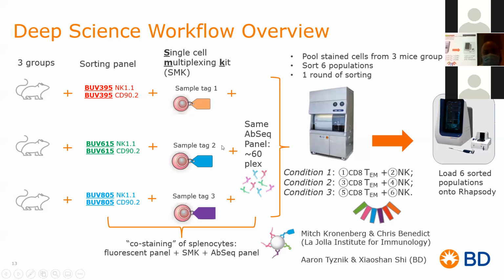After that, after we added the SMKs, we also added 60 antibodies for phenotyping. So remember when I mentioned that you're limited here, to be able to get 60 antibodies in a standard flow cytometry experiment, it's kind of unheard of right now, right? Right now, the most advanced I've seen in the literature is 40 biomarkers. And even in that study, you could see that they were just looking at very high generalities, not very in-depth. Here, you could go as far as you like.